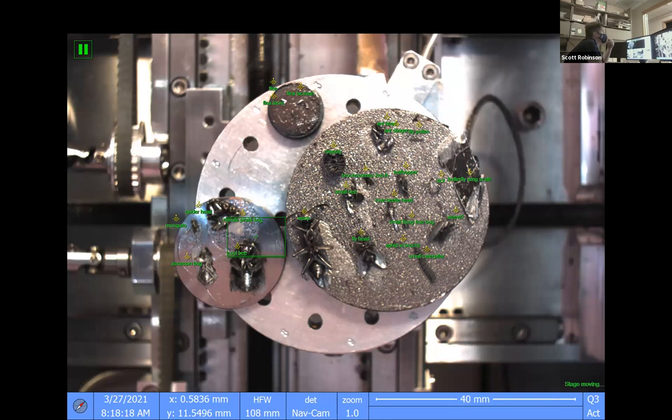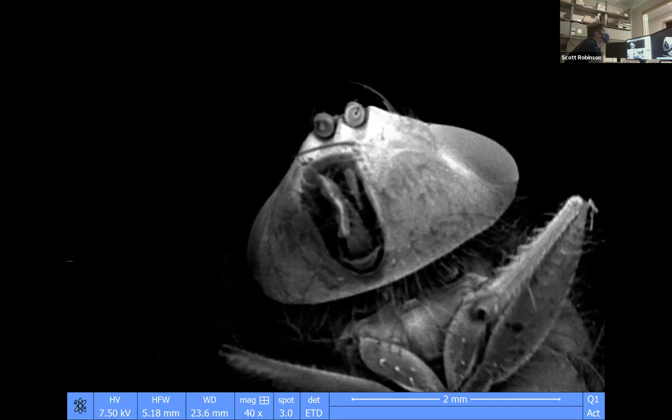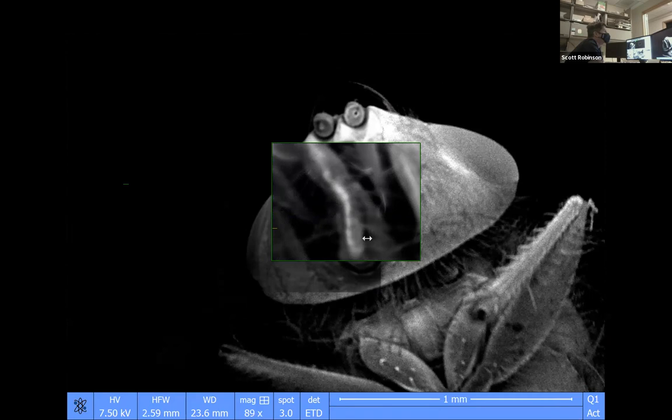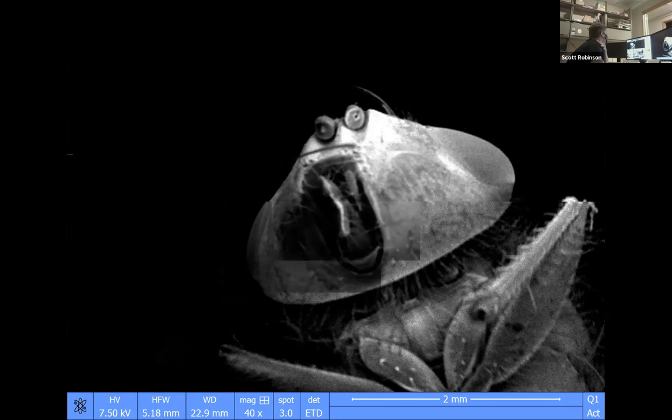So now you can see the screen that we're driving on, and we have a question. Haley wants to know what you study in school to work in this type of lab. My bachelor's degree is in entomology. So I basically just focused on studying insects ever since I started going to college. I don't know what your background is, Scott. I just do microscopy in general. Yeah, that's all I do.